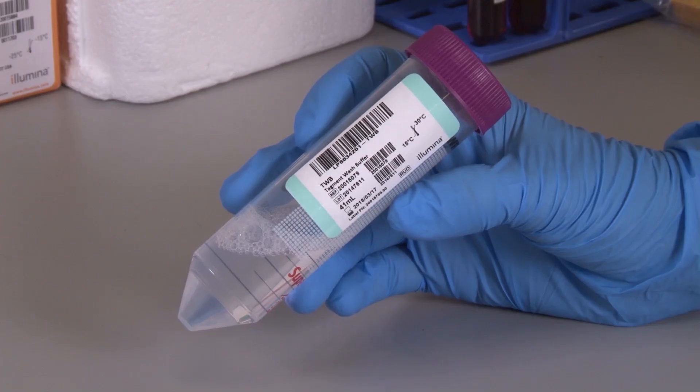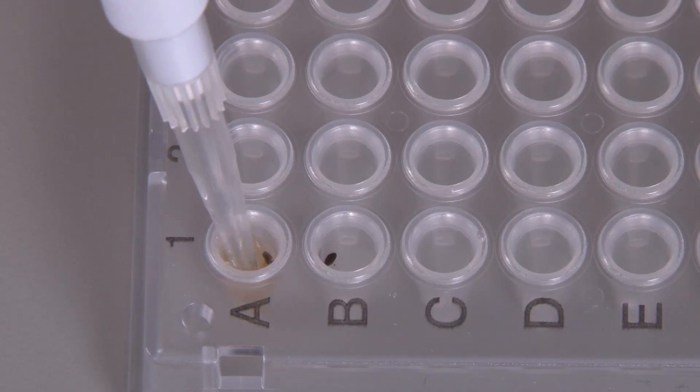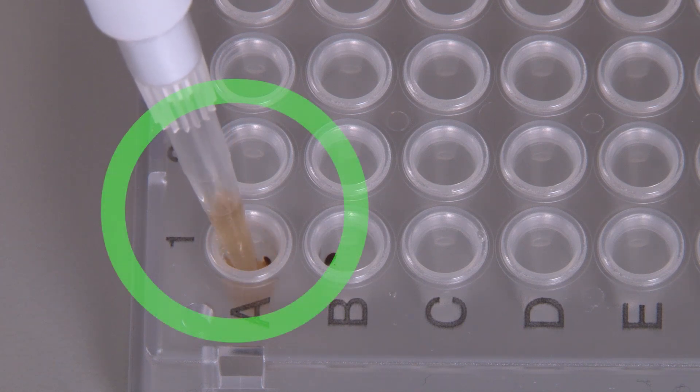TagMint WashBuffer needs careful handling for optimal success. When adding the TagMint WashBuffer to the beads, pipette mix until the beads are fully re-suspended.